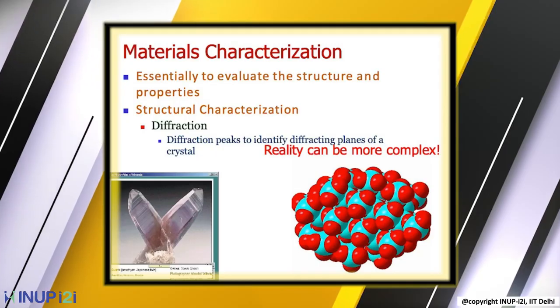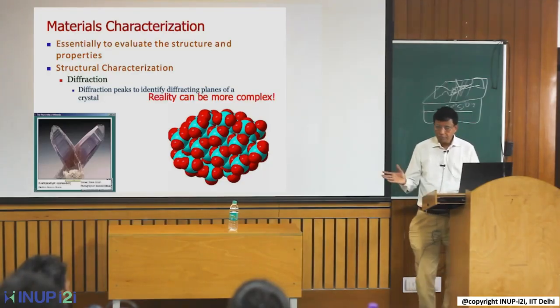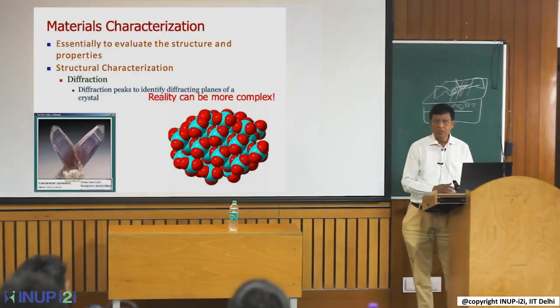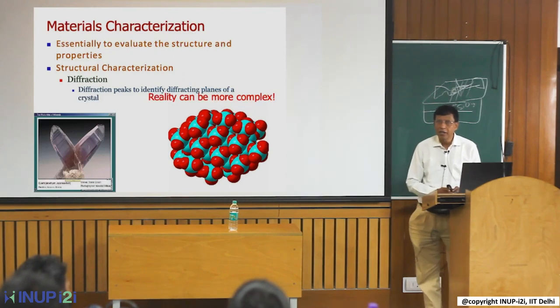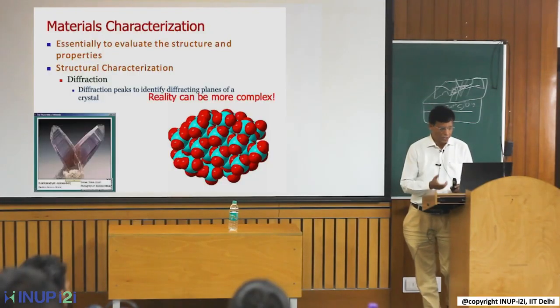As Professor Wansi was also mentioning earlier, when you make a material, it can be in single-crystalline form, polycrystalline form, or amorphous form. That is another thing we can test using the XRD facility.